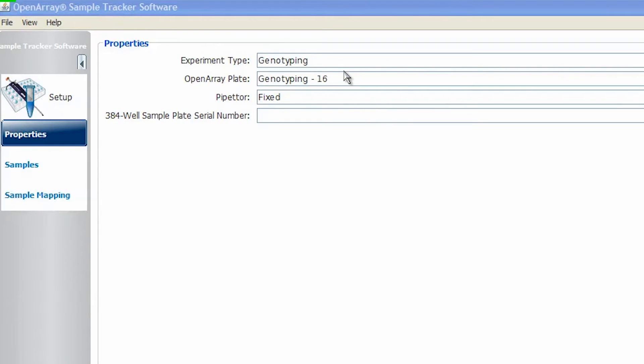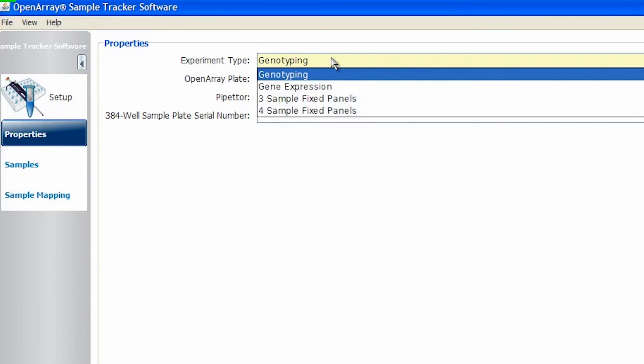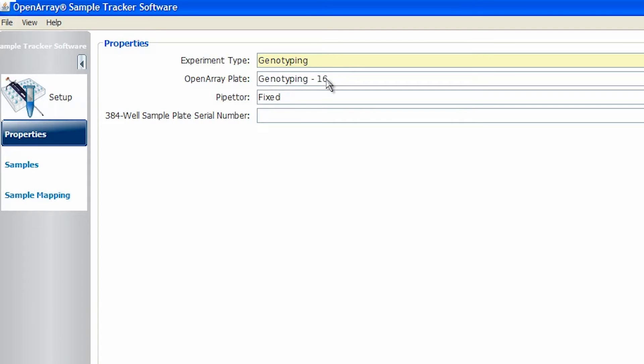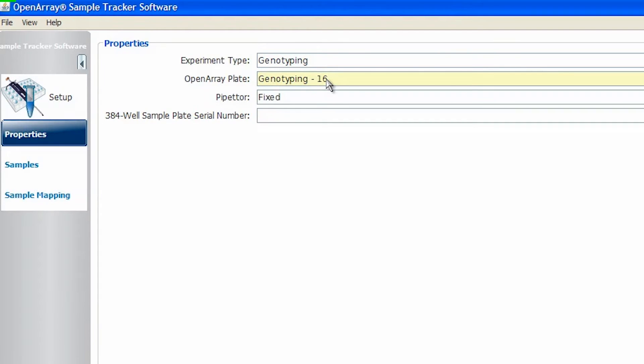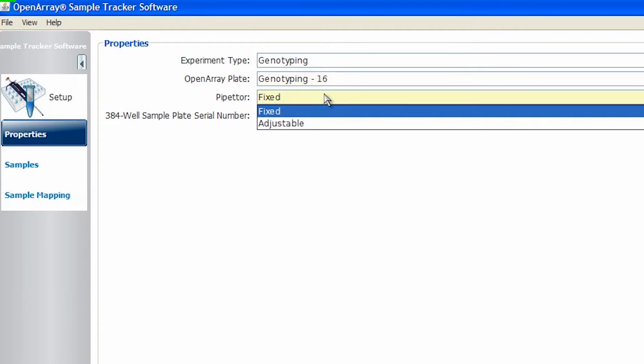Now, let's review how you create and store sample information. The Sample Tracker software is really great because you're able to create your sample layout and see how it translates from a 96-well format to an OpenArray plate. Here on the main setup page, you can choose your experiment type, desired number of through-holes per sample, and specify if you're using a fixed or adjustable pipette.